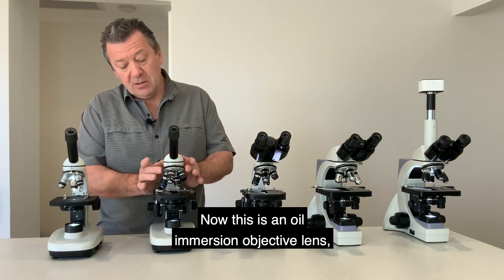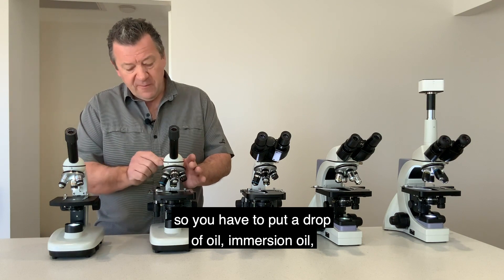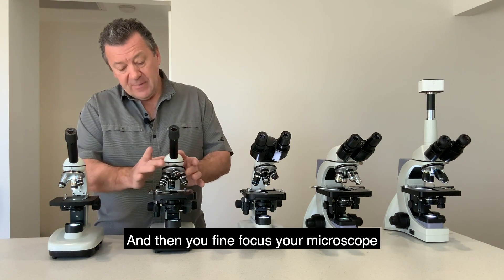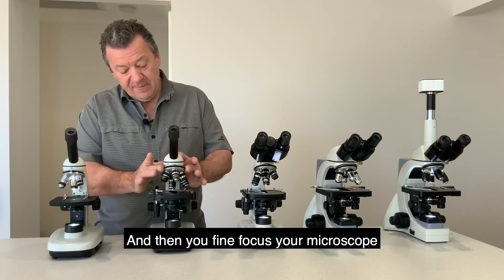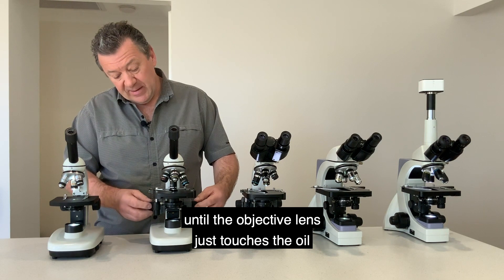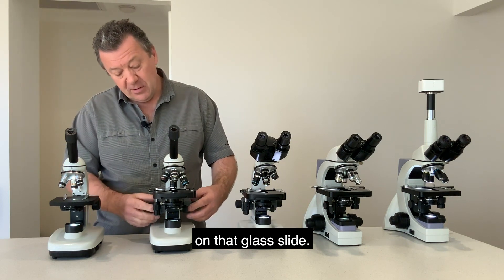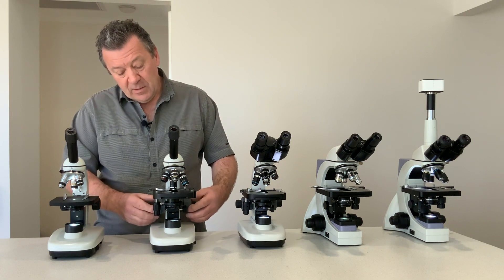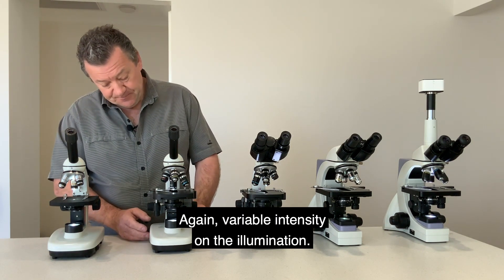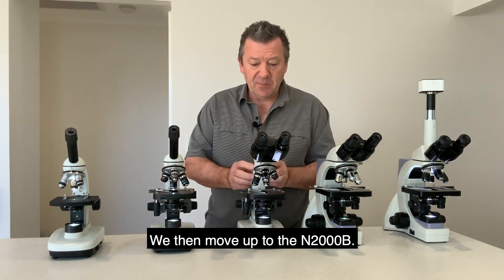The 100x is an oil immersion objective lens, so you put a drop of oil on top of your slide and then fine focus until the objective lens just touches the oil on the glass slide. Again, variable intensity on the illumination.